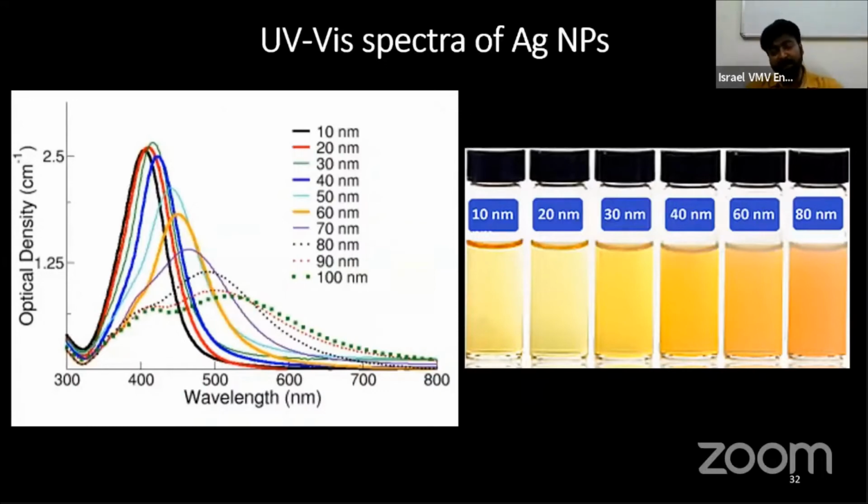You don't add any molecule at all to that. You don't substitute that with any other stuff. You don't even talk about the surfactant when you talk about the absorption, unless it is an aromatic molecule that is attached to the nanoparticle. Just the nanoparticle, just the metal, you don't have any difference in the composition. Just silver nanoparticle, and that gives you different absorption spectra depending on the size.